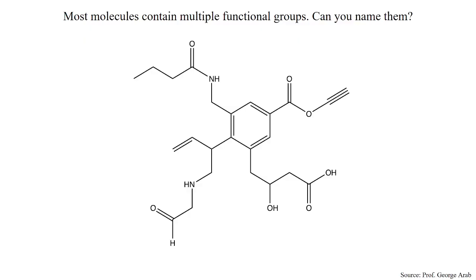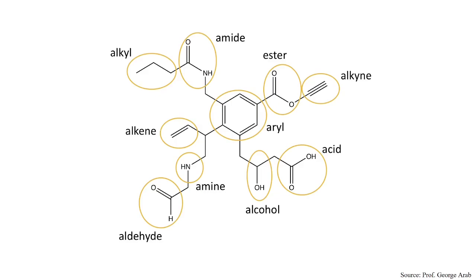Okay, so let's go ahead and show you the answers. All of these are the most common functional groups that you'll see in organic chemistry, and I highly recommend that you do your best to memorize them, because we might see some of these examples in the MOF 199 when we analyze our synthesized product using the IR spectrometers.